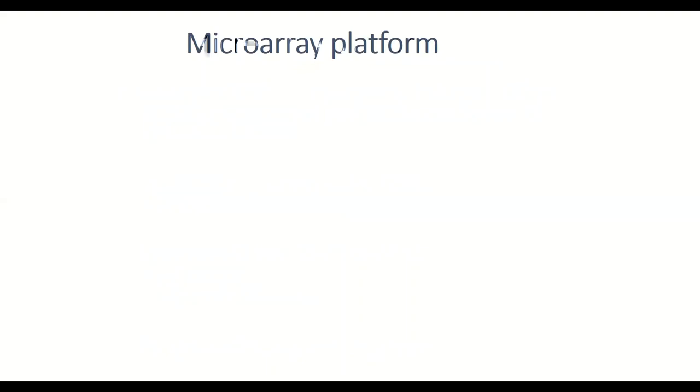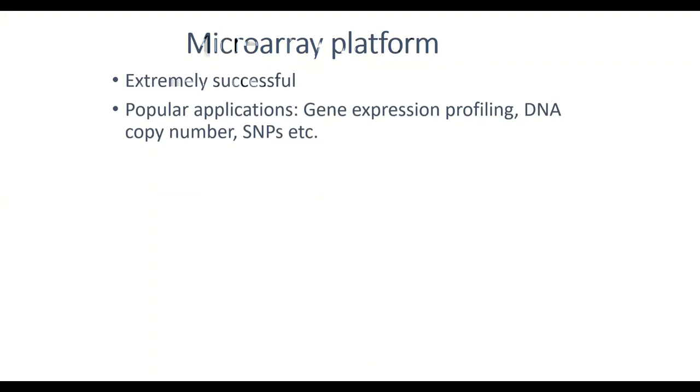And I want to briefly describe the microarray platform. This platform is extremely useful because, as I said, we are able to use it to generate gene expression data for all 20,000 genes simultaneously. So it's extremely useful in terms of gene expression profiling and DNA copy number analysis.